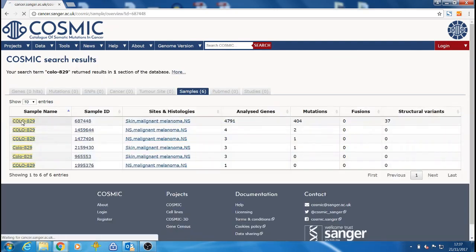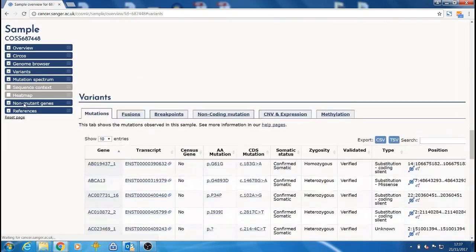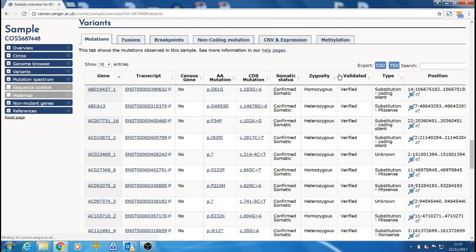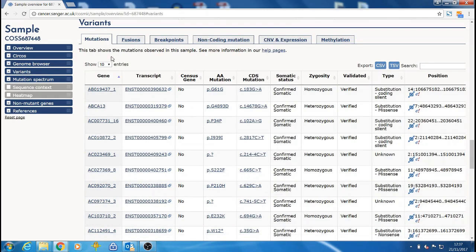From the main pages on the website, such as the sample page, you can download selected data relevant to what you're looking at on the website. You can download these in CSV or TSV format.